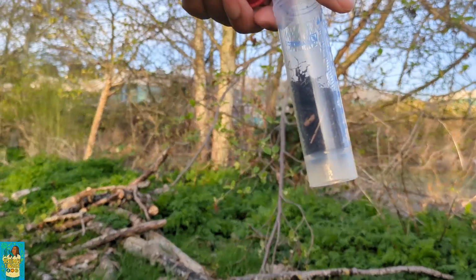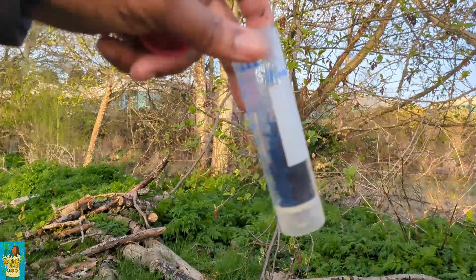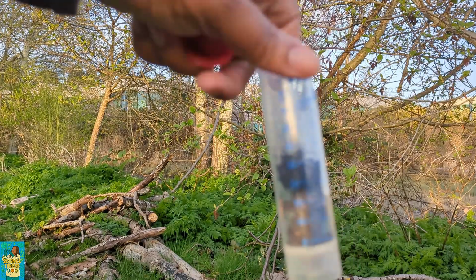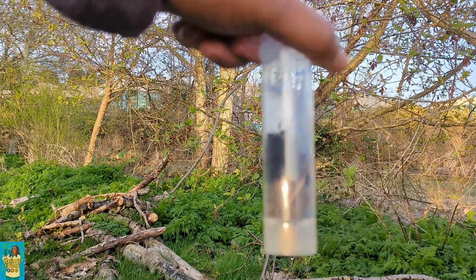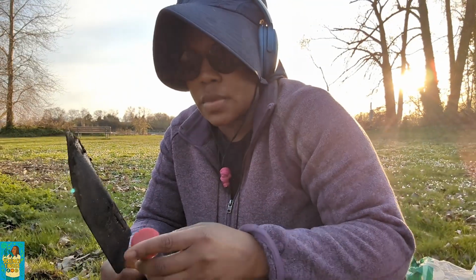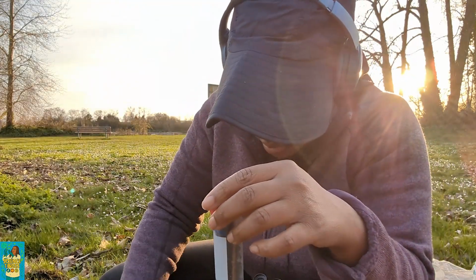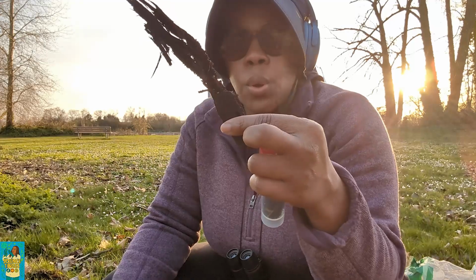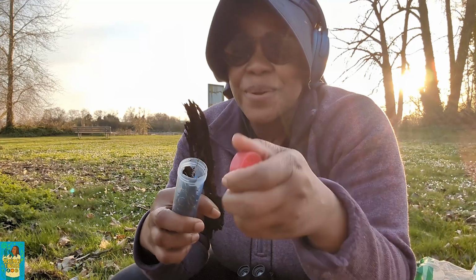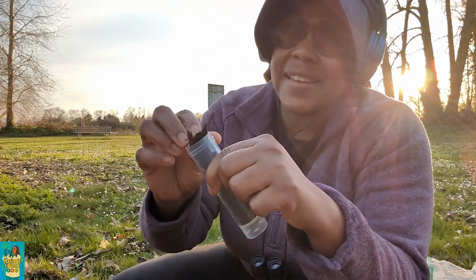I got some soil that has plant roots, some fine roots, and I'm going to get some of the decomposing, rotting tree bark to add to it. And then I'll go enjoy the sun setting. Yep, it smells very woody, very earthy. Okay, this is a lot, and all I need is 1 gram.